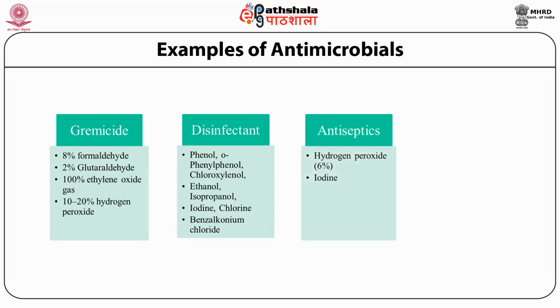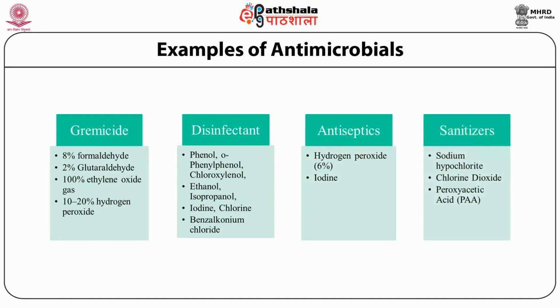Antiseptics. Under these, hydrogen peroxide 6% and iodine. Sanitizers. Under this, sodium hypochlorite, chlorine dioxide and peroxyacetic acid, that is PAA.